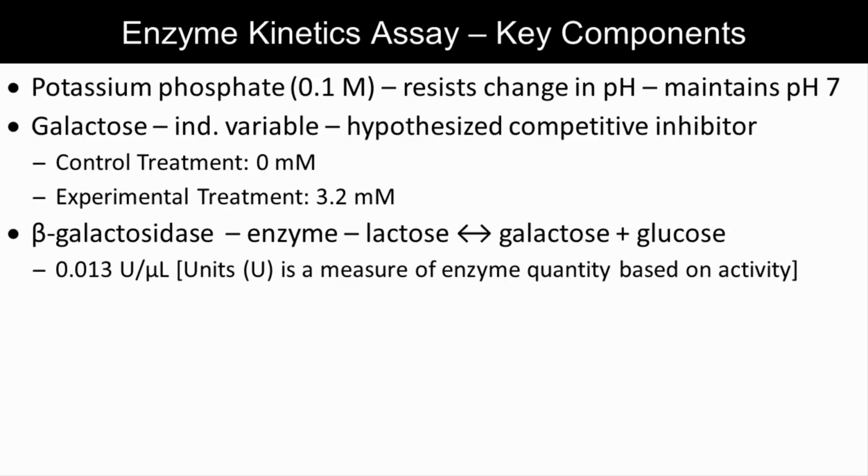This is probably the only time you'll ever see an enzyme kept at room temperature rather than on ice. But this is a particularly stable enzyme, which is why you can buy it in tablets from your local pharmacy. In fact, this was prepared by dissolving an over-the-counter lactase pill in buffer and filtering out the filler material.